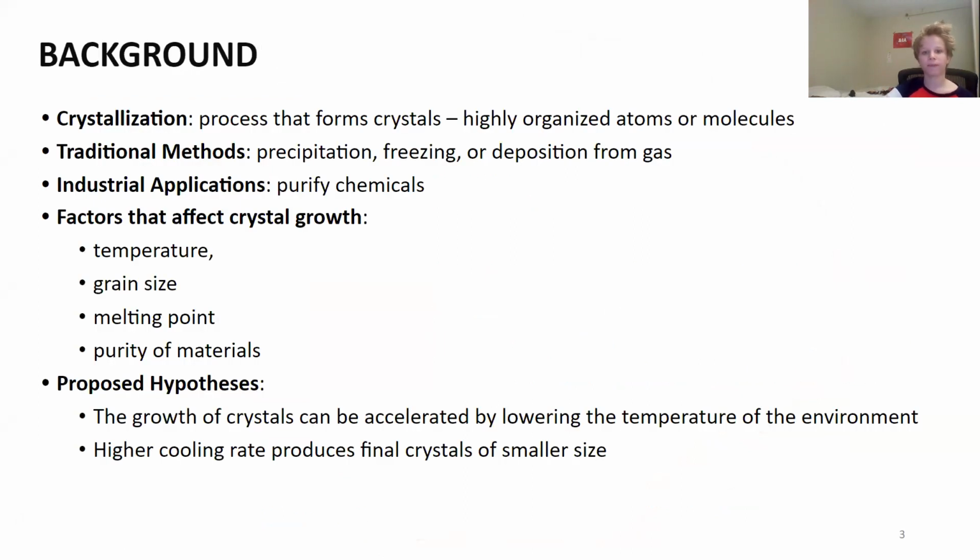Crystallization is a process that forms crystals, highly organized atoms or molecules. Magnesium sulfate is a naturally occurring mineral used to control low blood levels of magnesium.